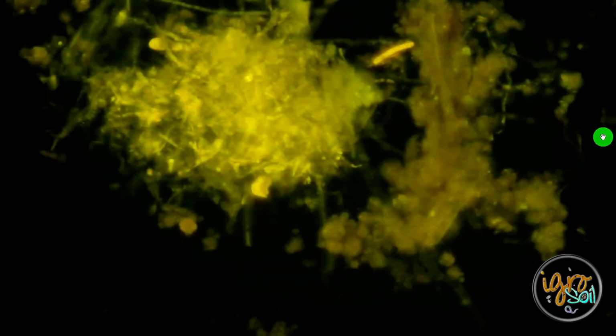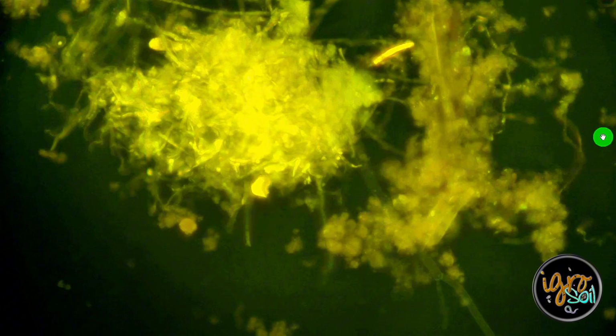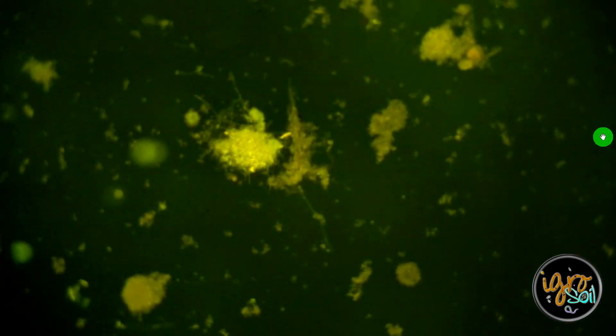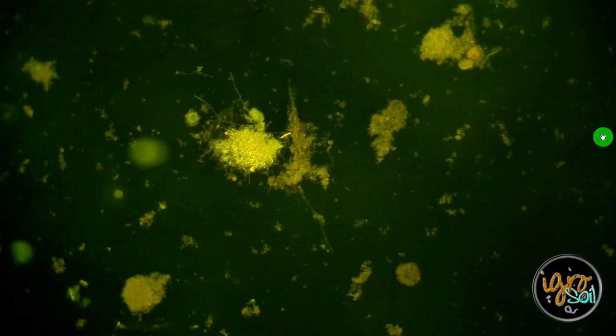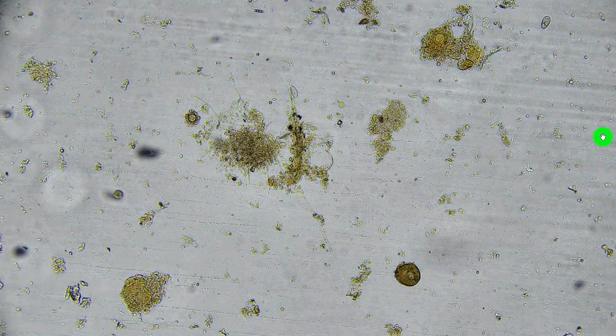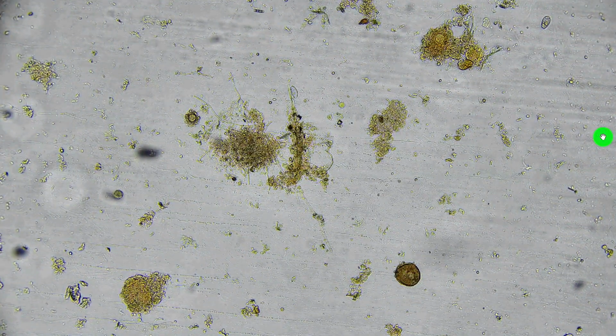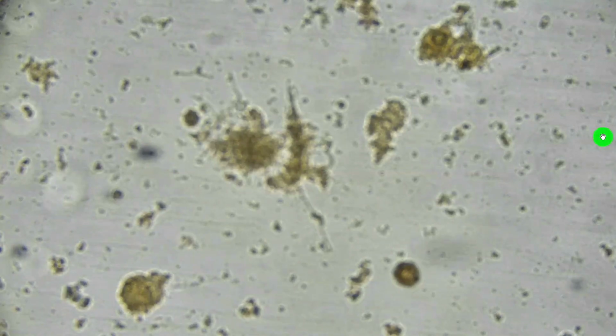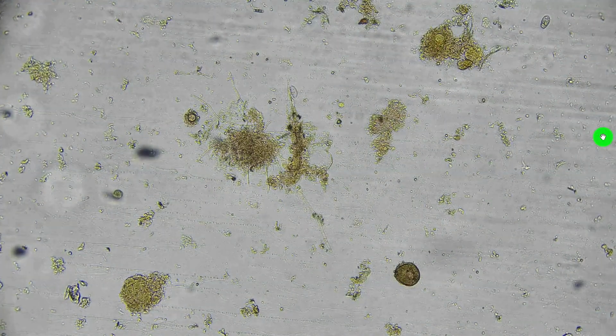Let's put the epi on that. Oof, dude, what? That is filled with nutrients, minerals of all kind. That's awesome. Matter of fact, let's back this up. Take a look from a distance. Wow, that's impressive. And then one more thing I'll do is let's put this filter back on. Let me tune in here, and then let's see what lights up here.